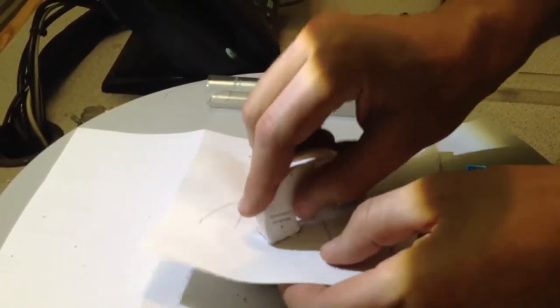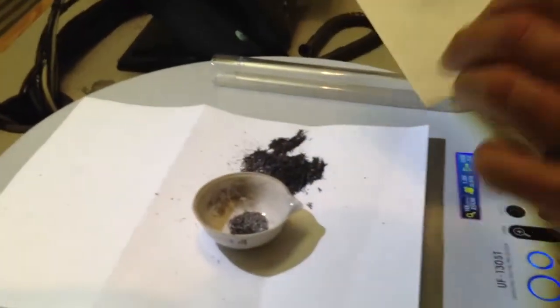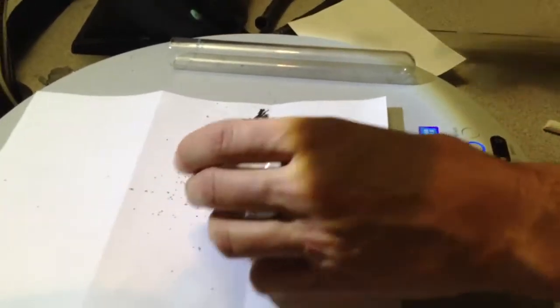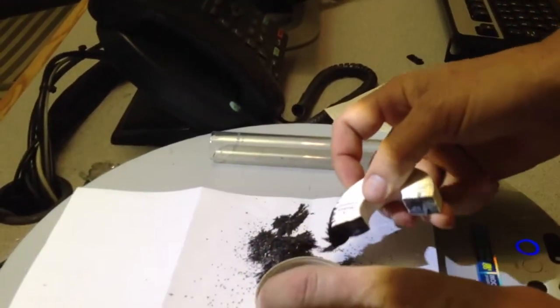I'm not getting a perfect separation yet, but you notice what's happening here?